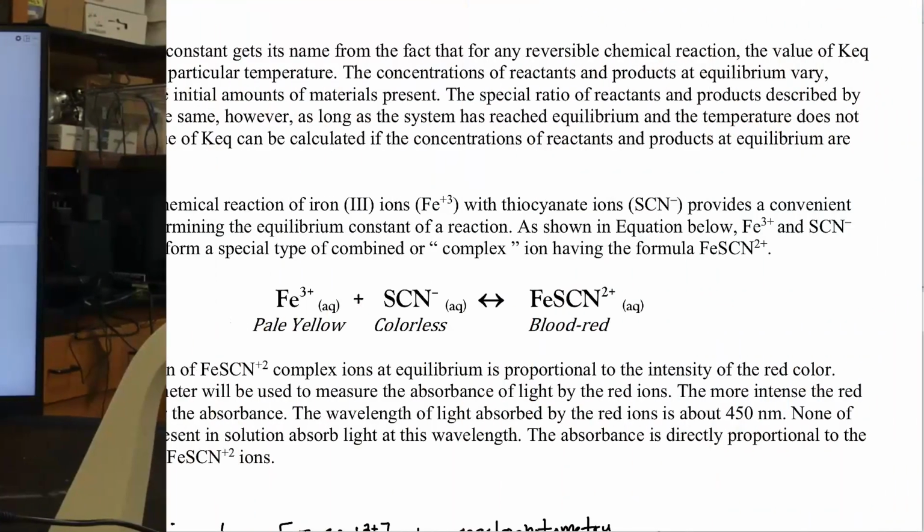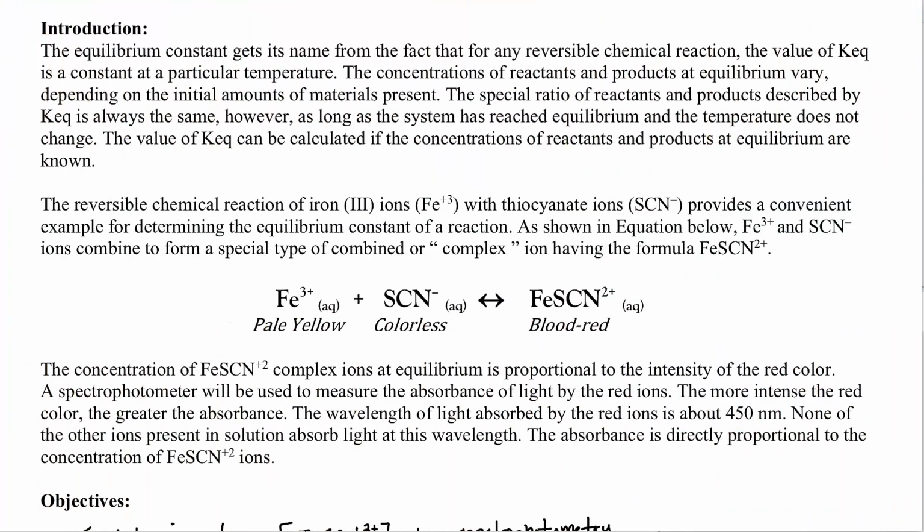So let's begin reviewing how we complete this Flynn lab, which by the way I think is one of the better labs they produce, and of course they're using the very, very infamous iron thiocyanate equilibrium reaction that is very common in many textbooks and essentially easy to deal with in the laboratory, even a high school science laboratory like mine. So in any case, we've got this equilibrium.